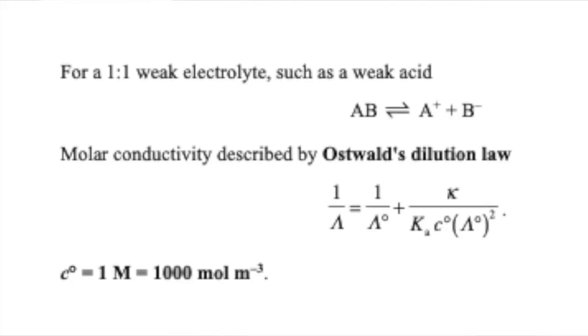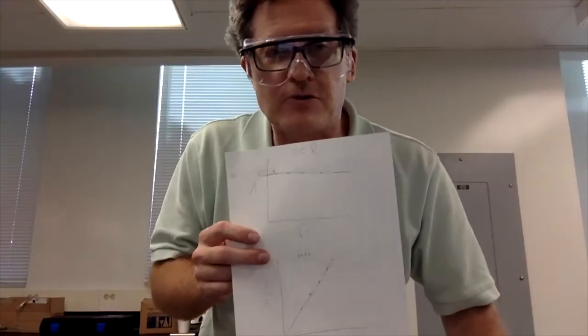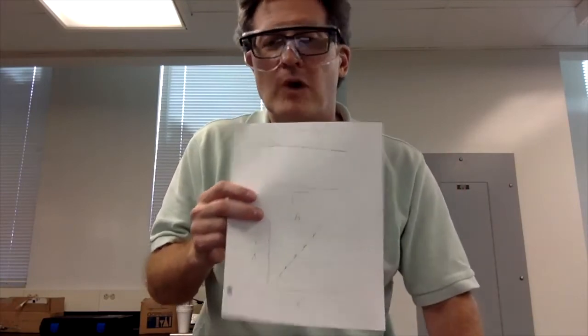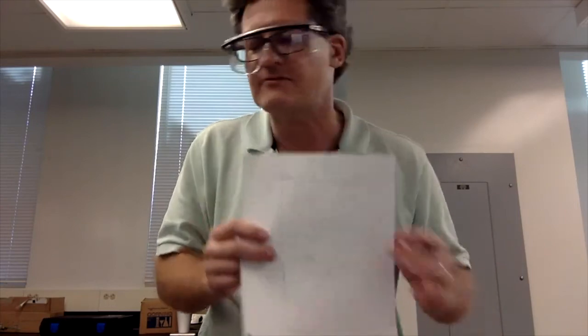Okay, now there are 2 points that I want to make here, right? In general, slopes are a more accurate way of measuring something than an intercept. Why is that? The reason for that is our measuring apparatus might have an offset. It might not be properly calibrated. There might be an offset that is given to it and you just have an offset from the real value.